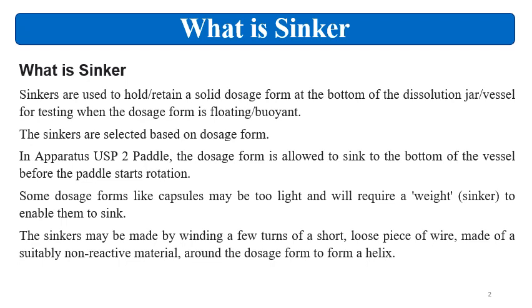See, generally the apparatus 2, that is paddle apparatus, USP apparatus 2, paddle apparatus is the common apparatus for many of the formulations. So in the paddle apparatus 2, the dosage form is allowed to sink at the bottom of the vessel before the paddle starts its rotation.